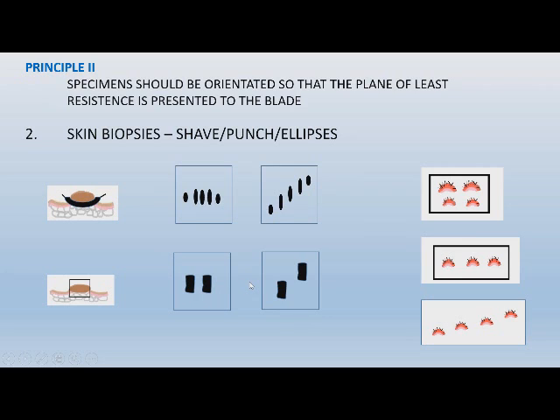And I can just hear you people out there thinking, how are we going to put that on a slide, because our pathologists like for their tissue sections to be in an easy row they can follow. Well, just turn it diagonally and put it on your slide like this. You don't need all that paraffin anyway, just wipe it off.